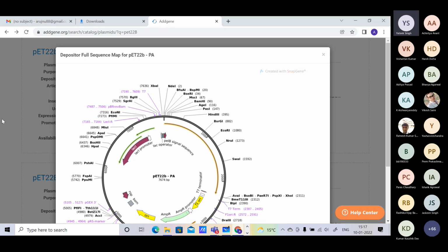So if one actually turns out to be a mutant, we will discard it and take the rest, because it is very difficult to have all 5 be mutants. It's not possible. The probability says that if you have 10, you will have at least one cell that has been mutated. We will discard it and we will have the rest of the 9 fine. So that's the logic. Understood, sir. Okay. So any more questions?